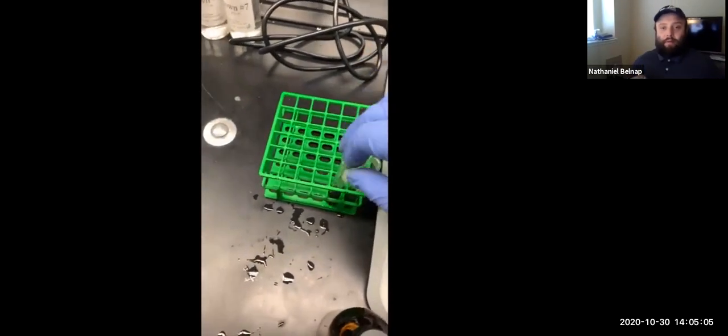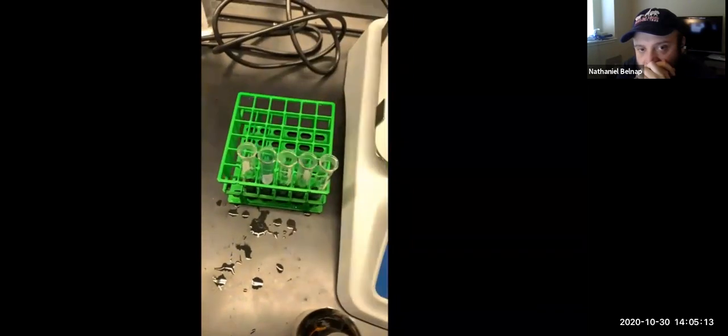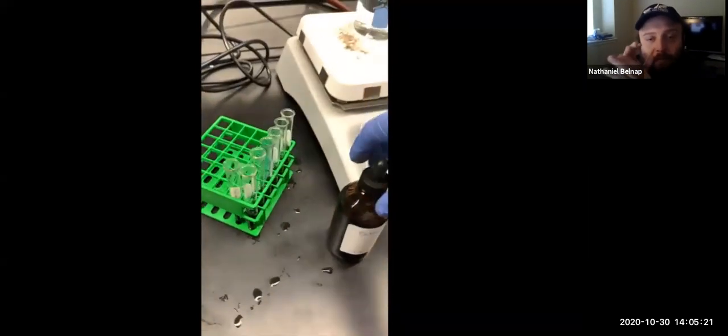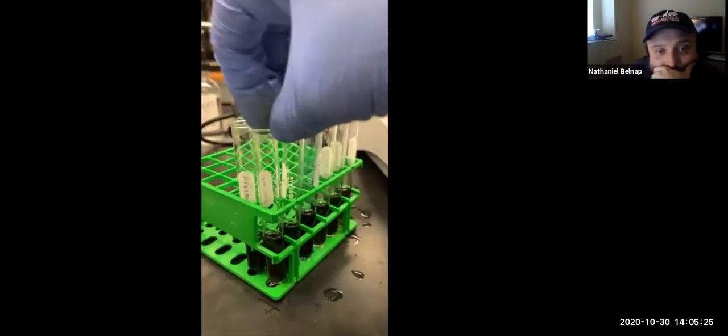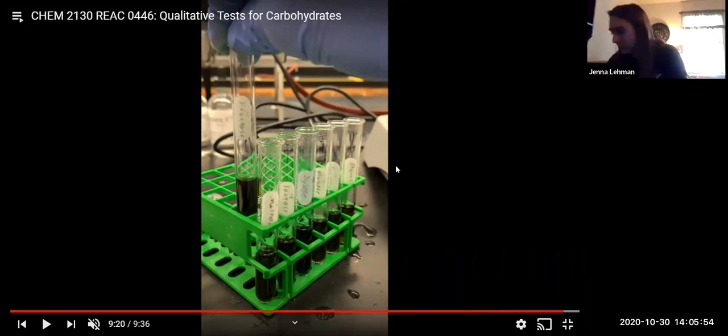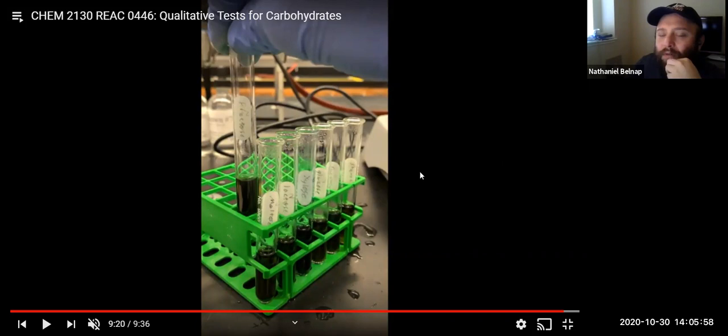Okay, cool. So let's see what we got. Fructose. All the colors kind of look the same now. Almost. So that looks like fructose. Looks like dark yellowish brown, right? So you guys say so? Okay. So would that be positive? I don't think for this one you put positive or negative. I think it's just brown. I think for this one you just put the color, no?